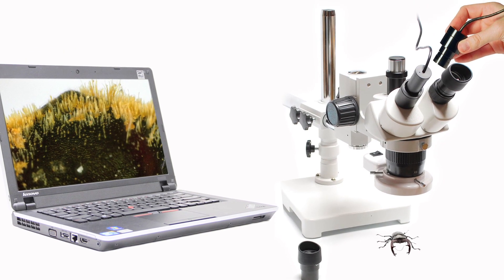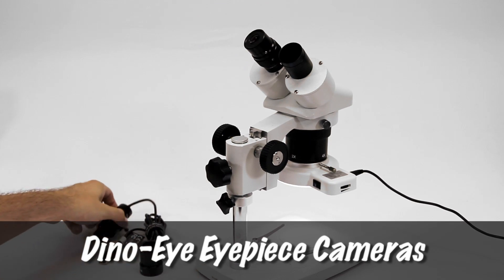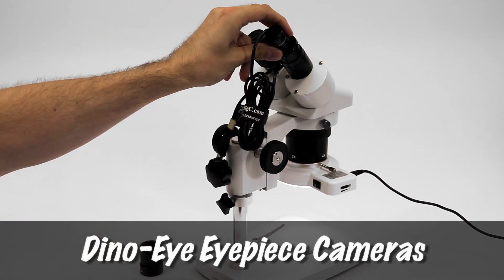Convert a traditional microscope to digital by replacing the eyepiece with a Dynolite eyepiece camera that uses the same included software.